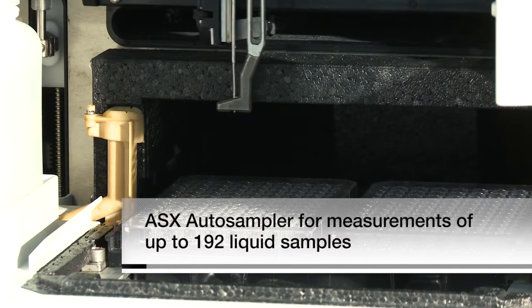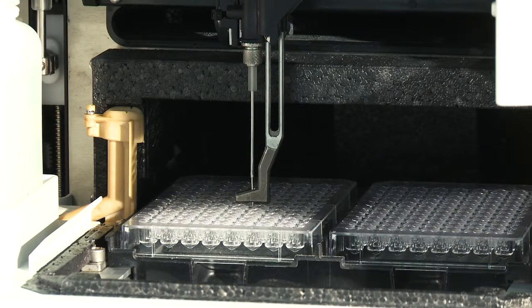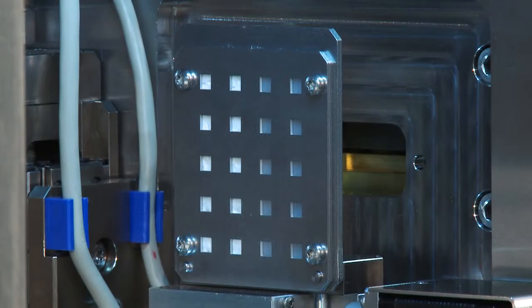To free up your working schedule, you can let the system work overnight, screening high amounts of liquid and solid samples.